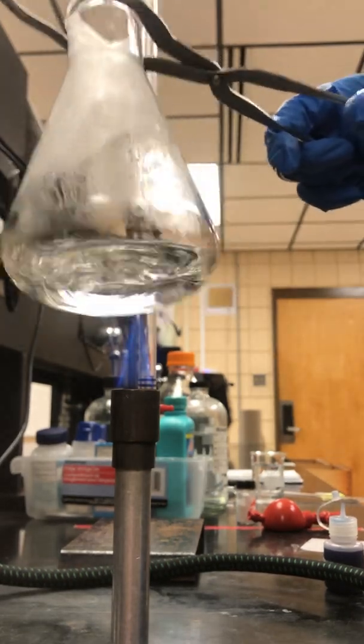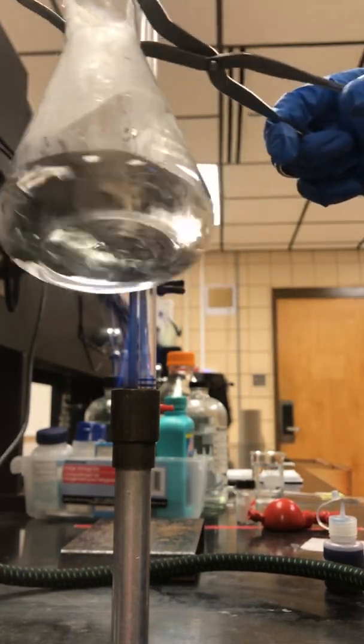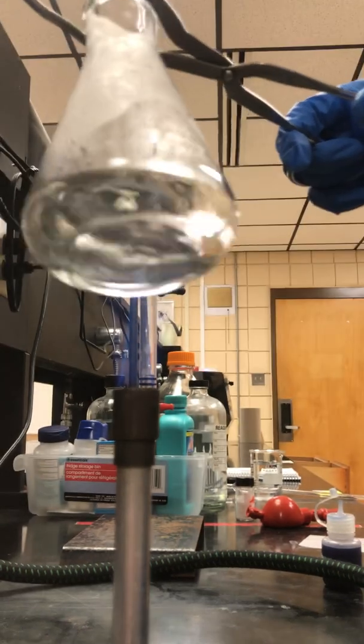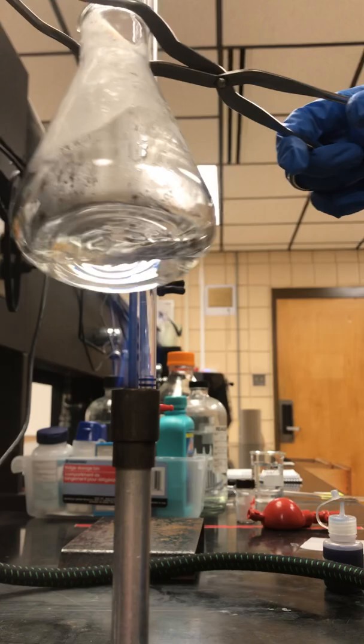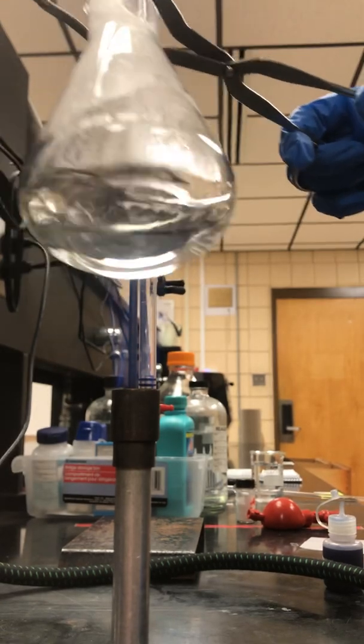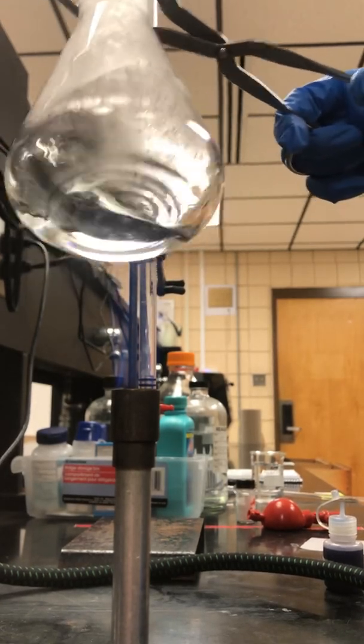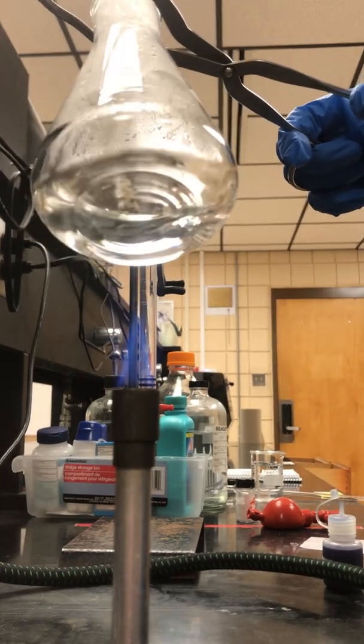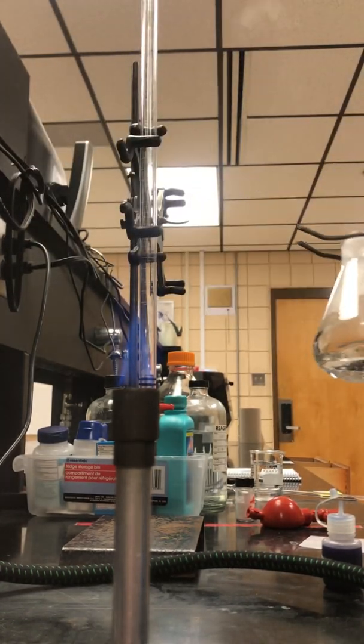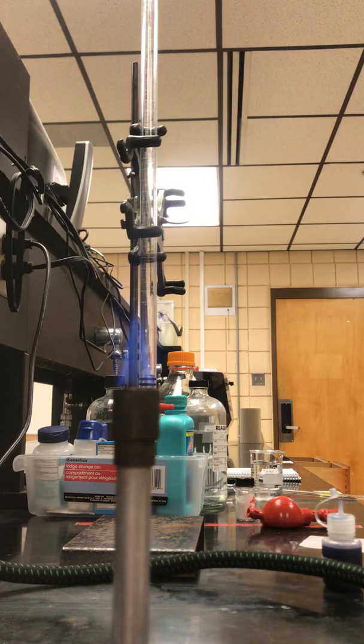Do this for approximately a minute. If you don't feel comfortable using the Bunsen burner or holding the flask with tongs, you could also use a hot plate and just sit it on a hot plate.